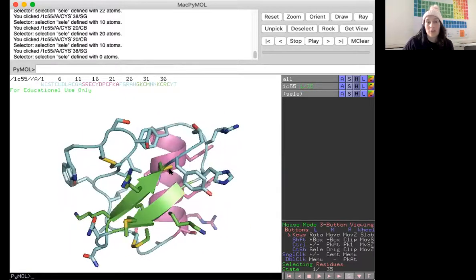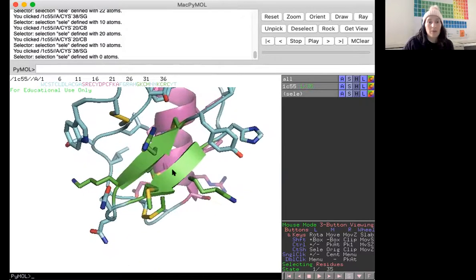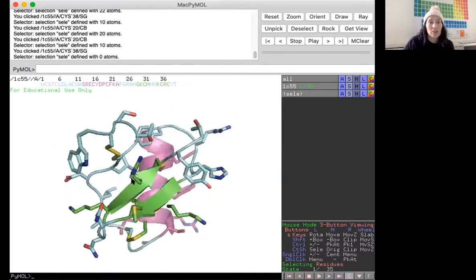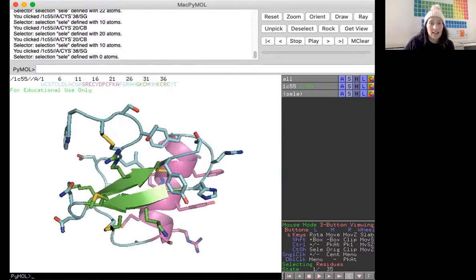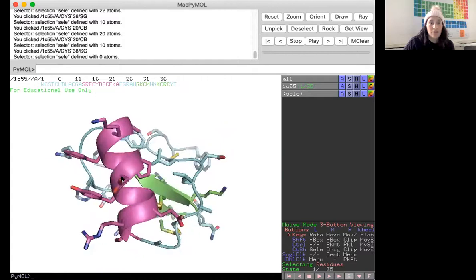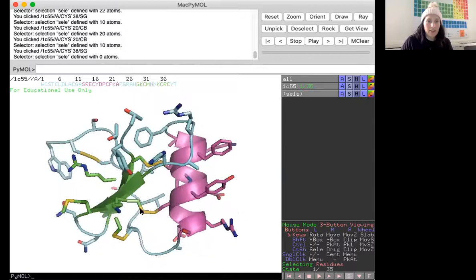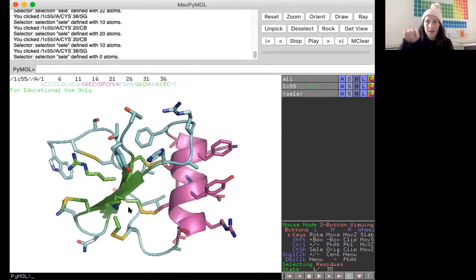So if the question wanted to see just the beta sheets and it asked for an image, I would probably want to get those as centered and easy to see as possible, right? If it was asking me to show the beta sheets, don't show me this side of the protein. This is the alpha helix side. I mean, it seems commonsensical, but come on. All right, but usually you just want to kind of get it squared up in this box.